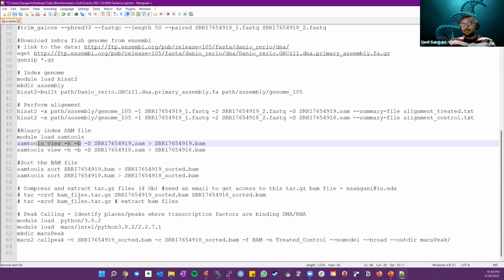It's easier for them to do their analysis. So they use a k-mer method to go through each set of base pairs or range of indexes to look for the binding regions. And it's better to have indexed BAM files to do that, to speed up their process, right? Otherwise, they will take longer.